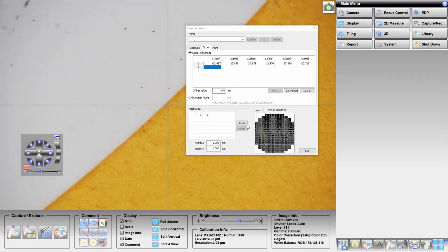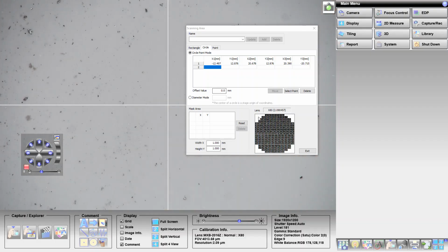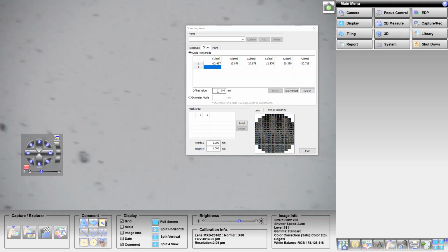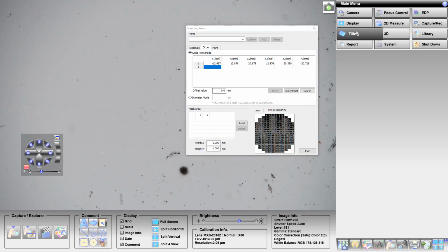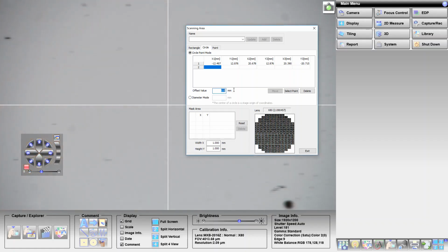This point, so here it found 200. We are now at 80 times magnification, it will need to do 200 scans, and because there is some edge which has no dirt, it's not using the entire filter. I calculated before something like 5 mm. I will choose here 4 mm out of security.